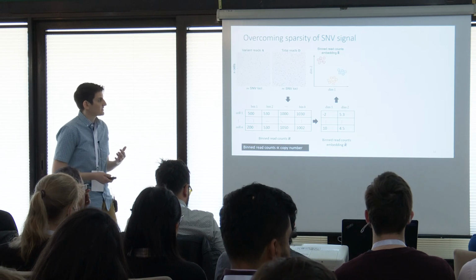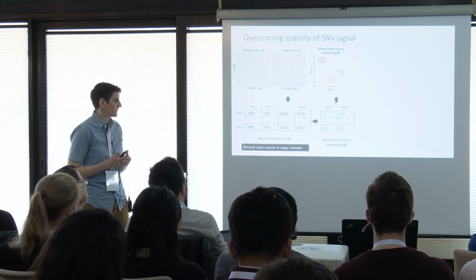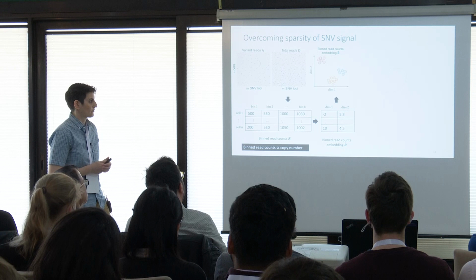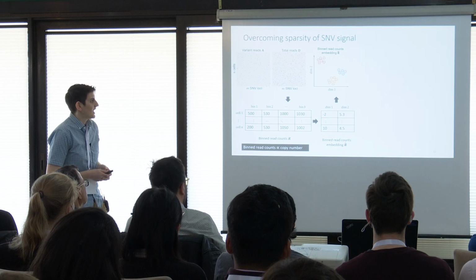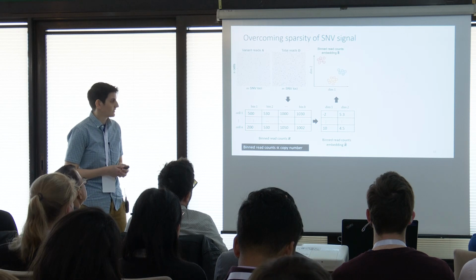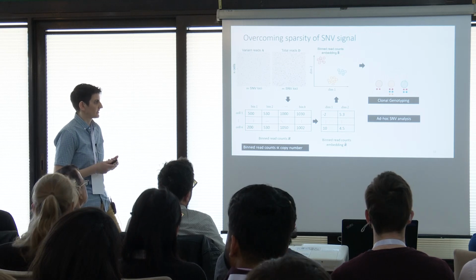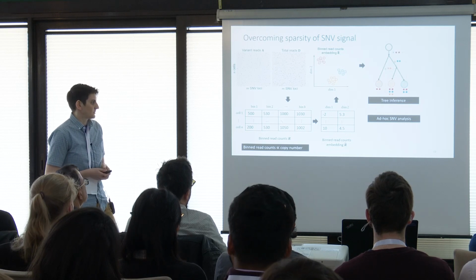As I said, this data is typically good for copy number analysis. So first you create a matrix of your bin read counts. You bin the genome into regions, and then for each cell in each bin, you count the total number of mapped reads, which is proportional to the copy number. Then you can take this matrix and project it into a low dimensional embedding. When you plot this, you can typically break out pretty clear copy number clusters. If you wanted to perform an ad hoc SNV analysis, you can take these clusters and genotype them by pooling the cells together. Then you can use these clones and try to infer a tree on these inferred clones.